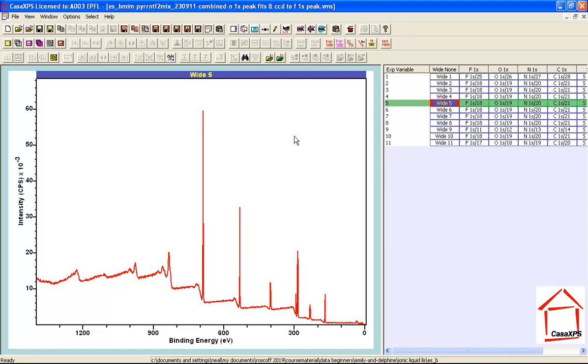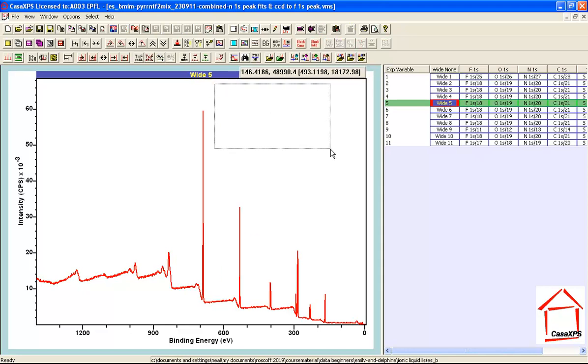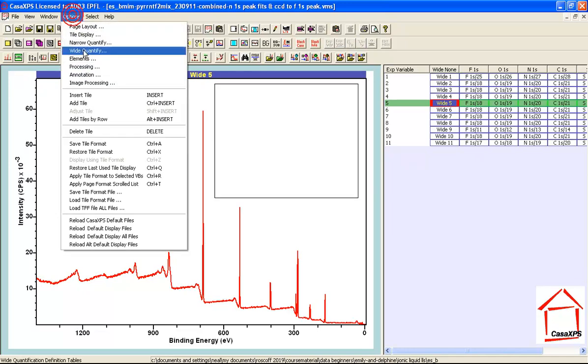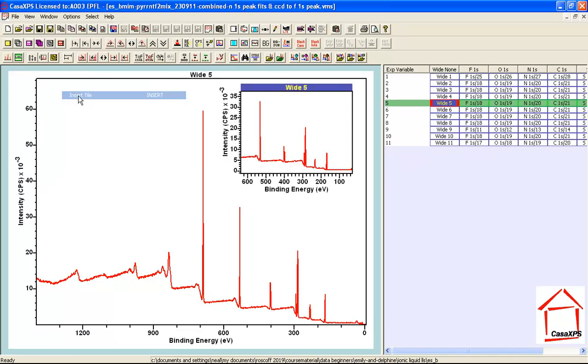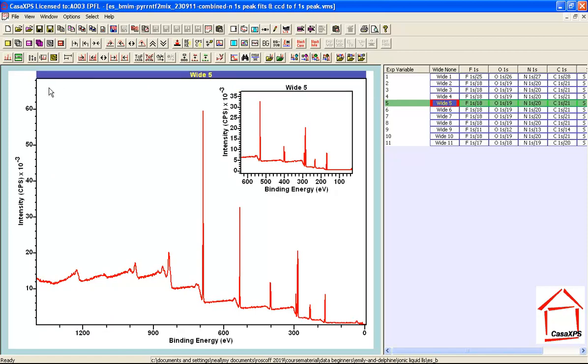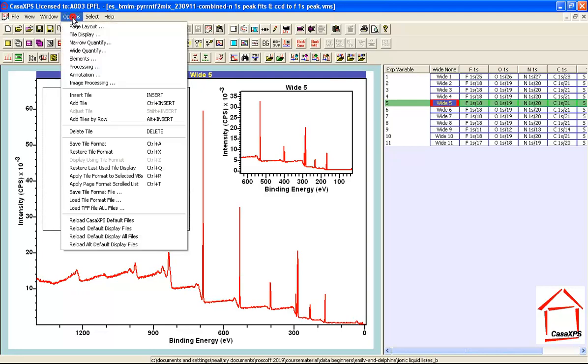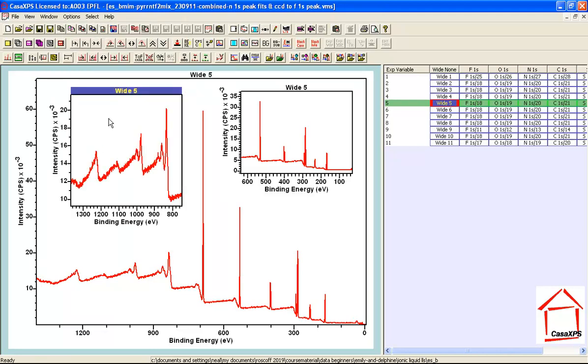I can now add tiles to this tile by dragging out boxes. So if I drag out a box here and then use the options menu and say insert tile, I've created one tile by giving focus to the survey spectrum, dragging out another box and then saying options insert tile. So now we have two tiles that are associated with this particular tile that is now displaying the survey spectrum.